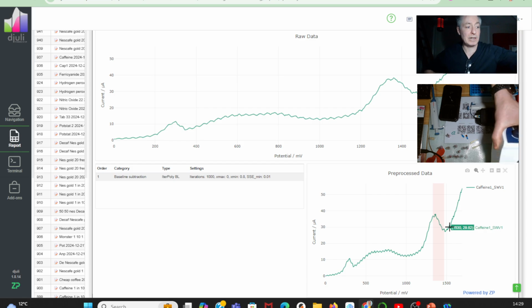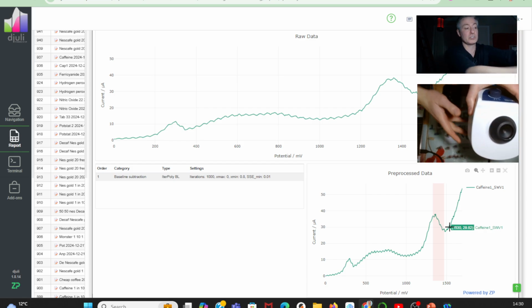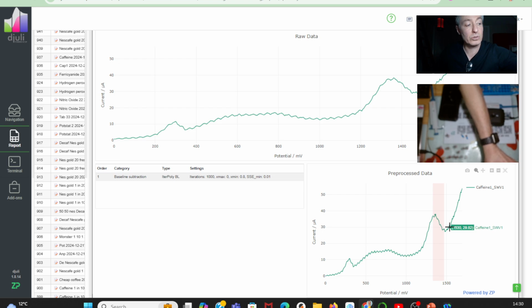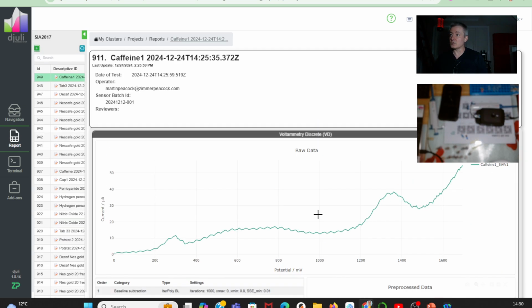I think I'm always very clear in many videos, if you watch back over the years, I'm always vortexing. That really helps with extraction. Vortexers are not expensive. The other way of doing it is to shake by hand, but you're just never going to get the thousands of vibrations per second that a vortexer can produce. And then what I'm really interested in is the actual raw signal.